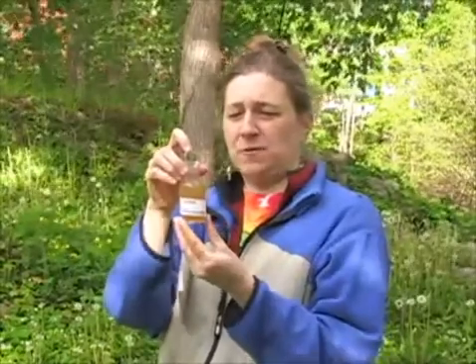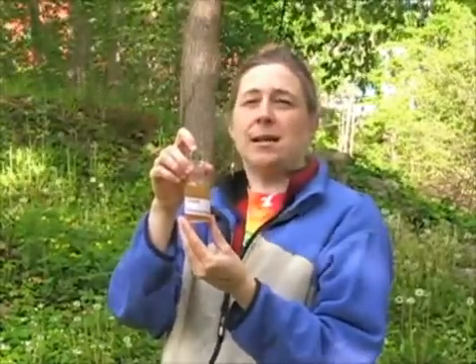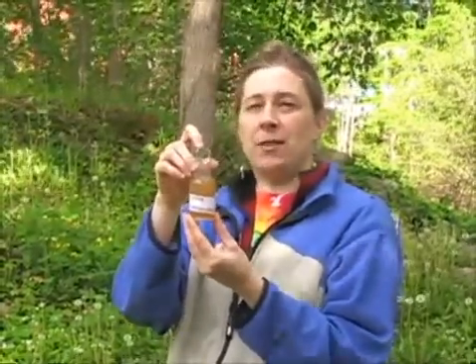All right, after you add the reagents, the bottle contents get really cloudy and flocculent. There's a bunch of stuff floating around, and it has to sit and settle out for a few minutes before you can add the 3rd reagent.